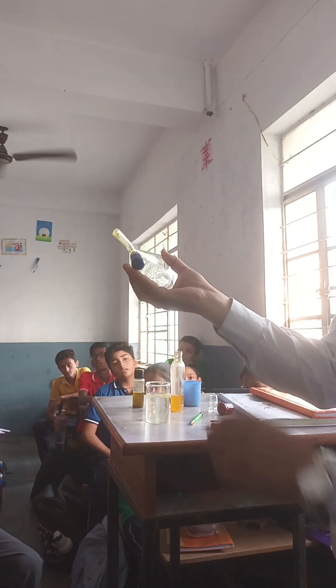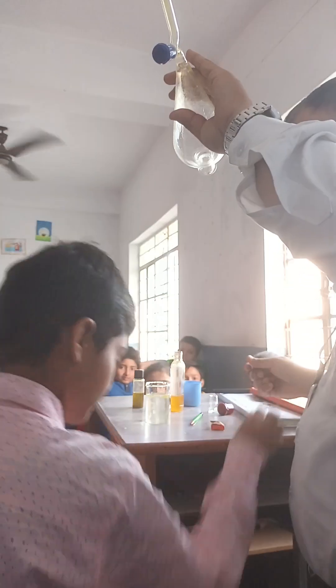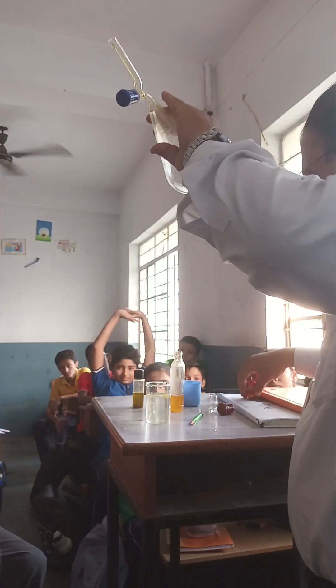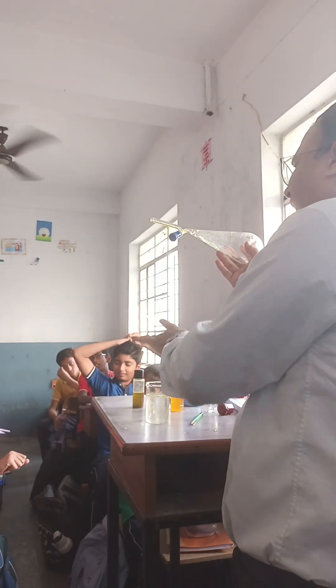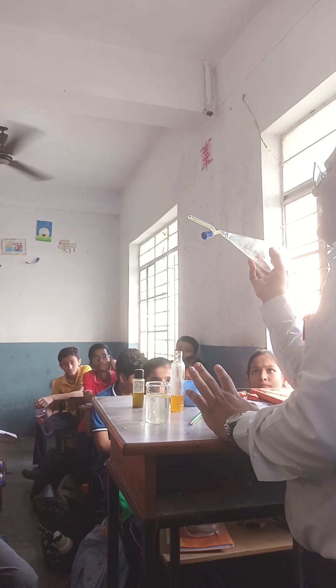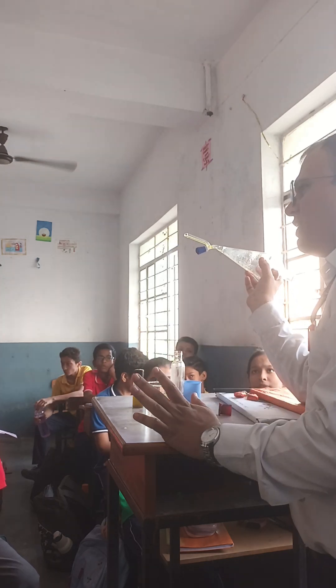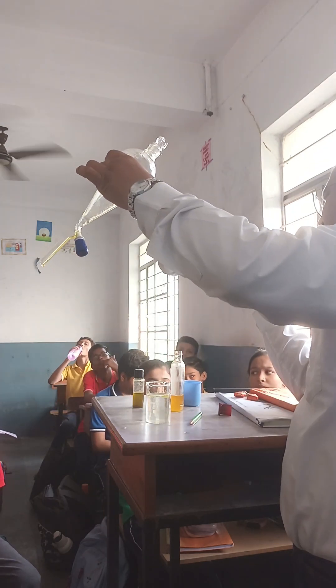So mustard oil will be separated completely. Mustard oil and water will be separated out very easily by using this separating funnel.